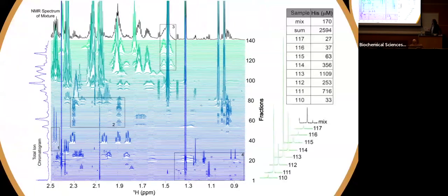Okay. Now, sensitivity-wise, and this is related to these small peaks, to quantify the sensitivity. First of all, let me say that we injected about 15 times the mass of Neurospora into our HPLC as I'm using as the example trace to show for the unfractionated material. So 15-fold excess, because we just do multiple injections on the HPLC and then collect the same fractions in the same tube. So the peaks right here in green are histidine, one of the peaks that's free that we can integrate in the unfractionated spectrum and also see clearly in the fraction library.